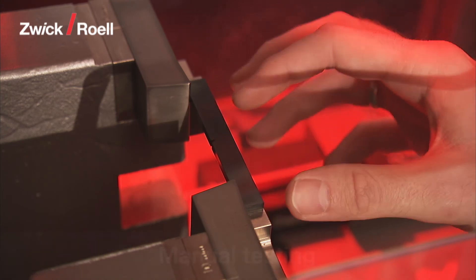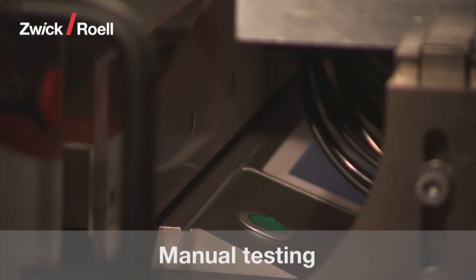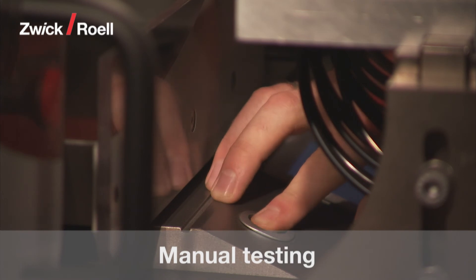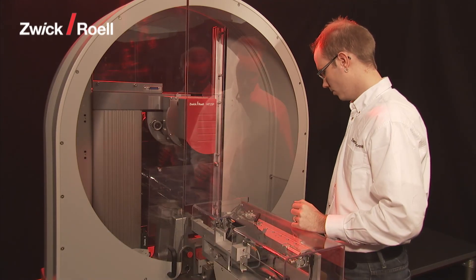The automatic testing system shown here can be used for manual tests whenever required.